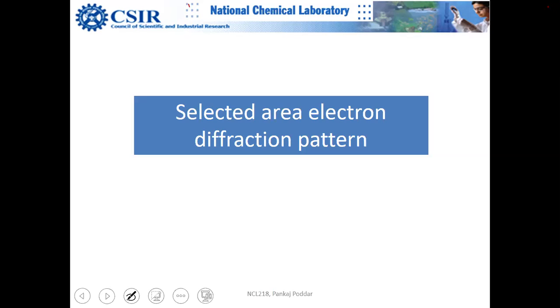See, the challenge in Raman is sample amount. If you have a very small amount of sample, for example this graphene quantum dot, sometimes it's very difficult to get Raman scattering. The Raman signal is so faint. The Raman scattering cross section is very weak.